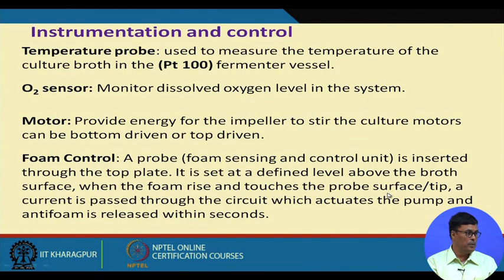So these are the principles, and there is a temperature probe also, an oxygen sensor also, a motor, and the foam control device I already discussed. Thank you very much.